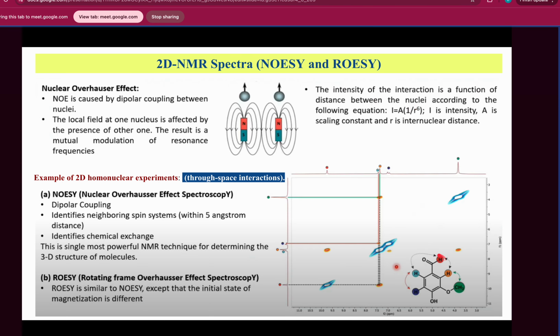So in this scenario, this particular red hydrogen is interacting with the yellow hydrogen. So they are lying close to each other in space, but if we look at the bond separation, then they are separated by these 4 different bonds. Which means that there is some kind of coupling which is also happening due to their closeness in space as well. Whereas if we talk about this green hydrogen and this red hydrogen, then they are lying far away from each other. So in this case, the coupling effect will be very low. It will be nearly zero.